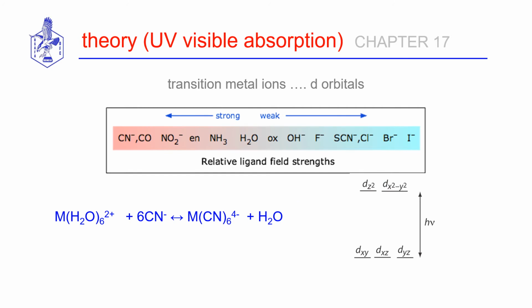One other interesting application in studying transition metal ions, and remember those are the beautifully colored ions. Think about copper and the blue solution, and nickel and the green. So obviously these are species that do absorb in the visible spectrum. And one other interpretation and analysis we can decipher important information about our transition metals is if they're complexed by different ligands.